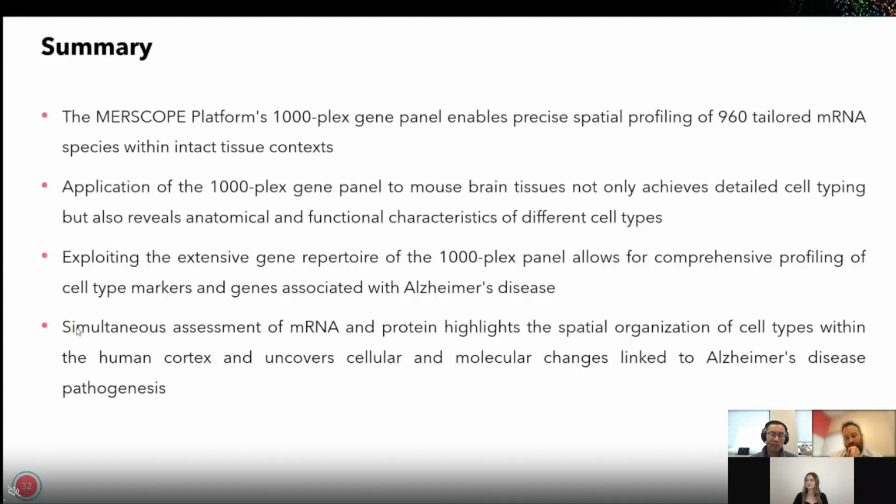There may be some specific labeling methods. In that case, maybe we can use a cell segmentation algorithm to do that. I think recently we implemented Cellpose 2 in our segmentation tool. That means if the labeling is very sparse, like if you include some fluorescent labeling, maybe you can train the algorithm to assign some distal transcripts to the cell.